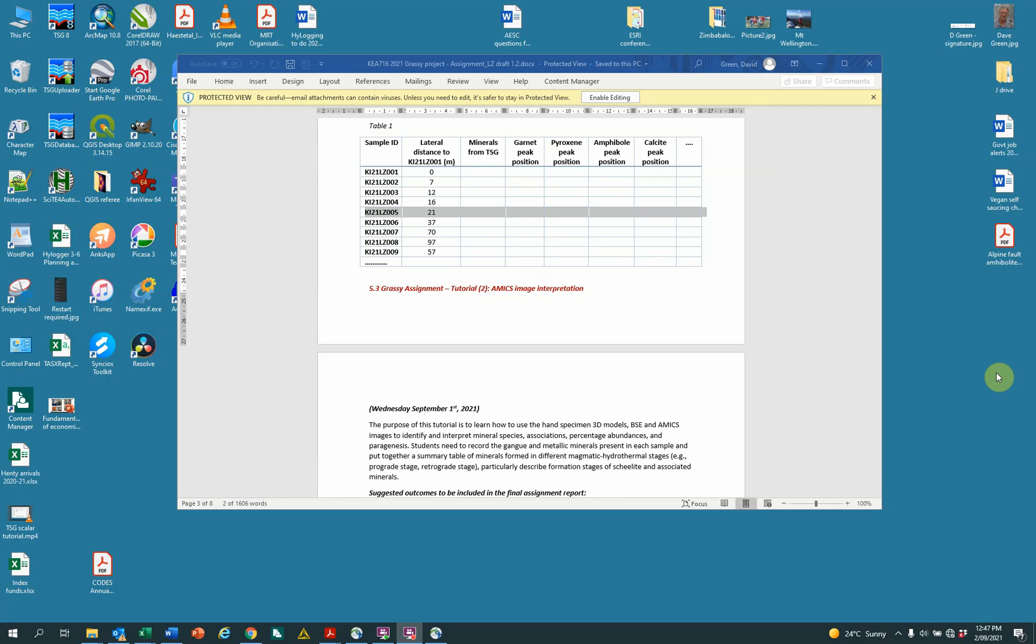Hi, David Green here. I'd just like to take you through a tutorial on extracting compositional scalars from thermal datasets, like the task for getting information out of garnet. So the idea is, for each sample, to get a handle on the composition of the minerals by monitoring peak positions of these four different minerals.